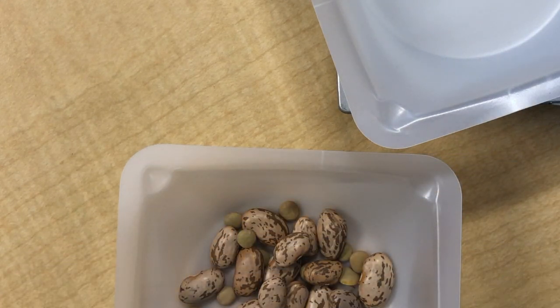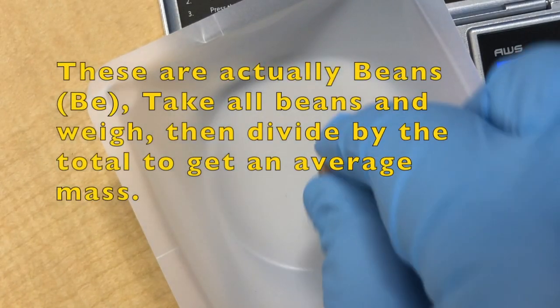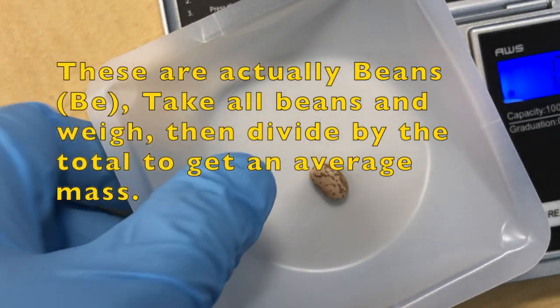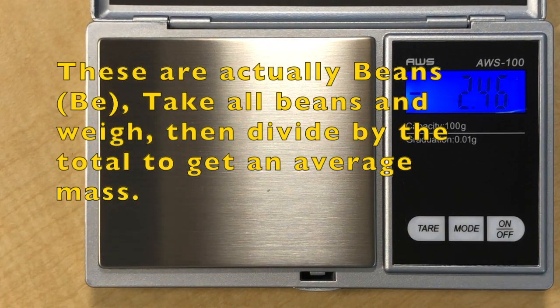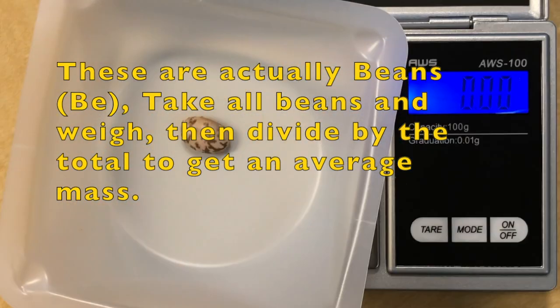Separate the lentils and soy. Make sure you wear gloves so you don't transfer moisture. Zero the weighing boat and then place your 20 lentils.